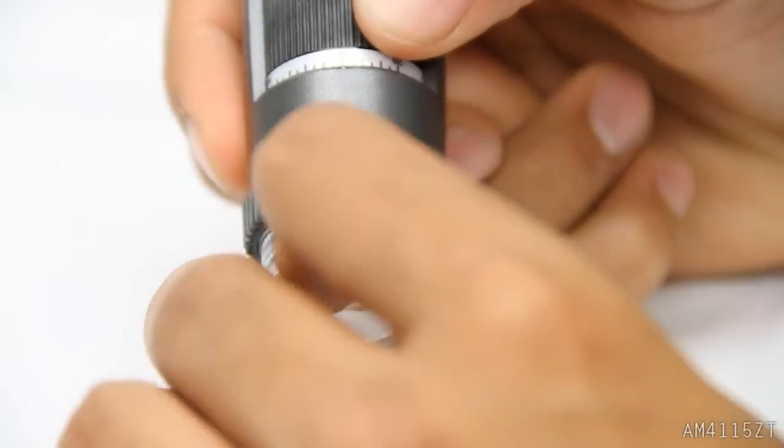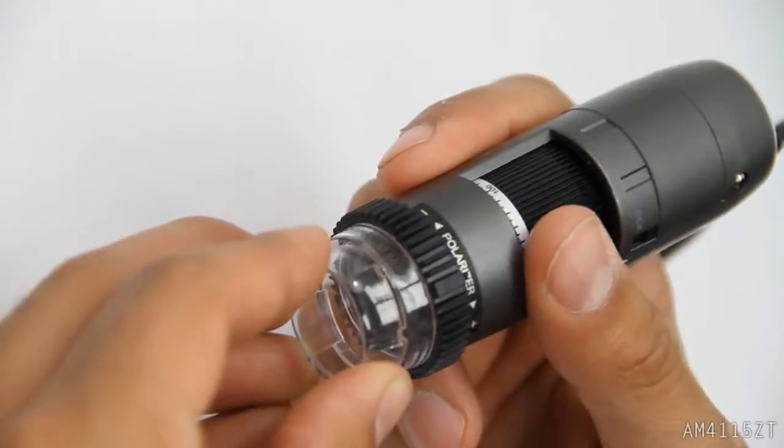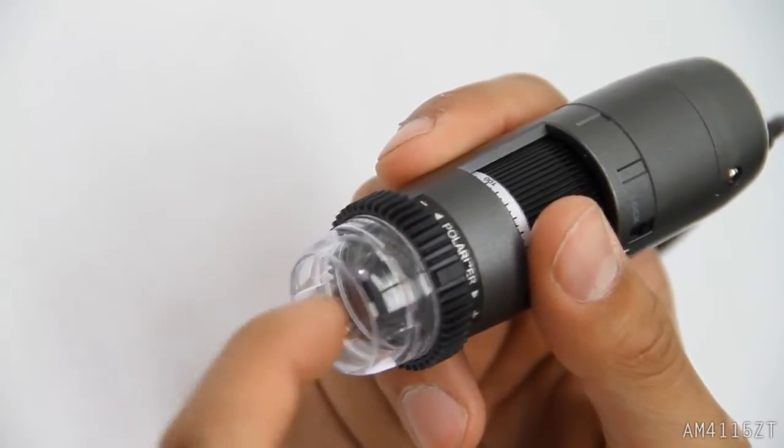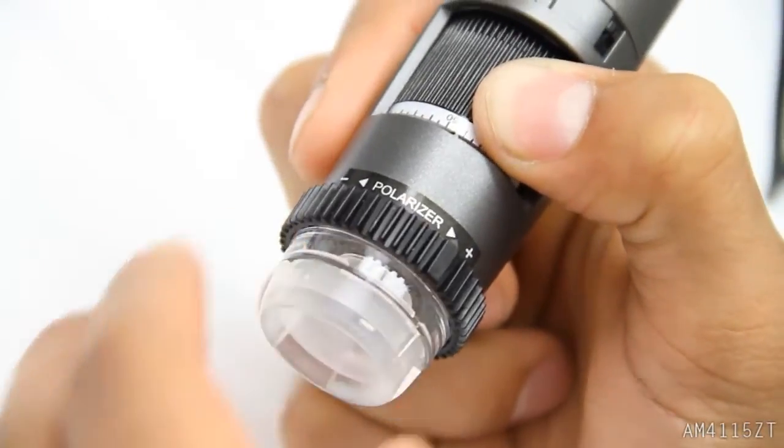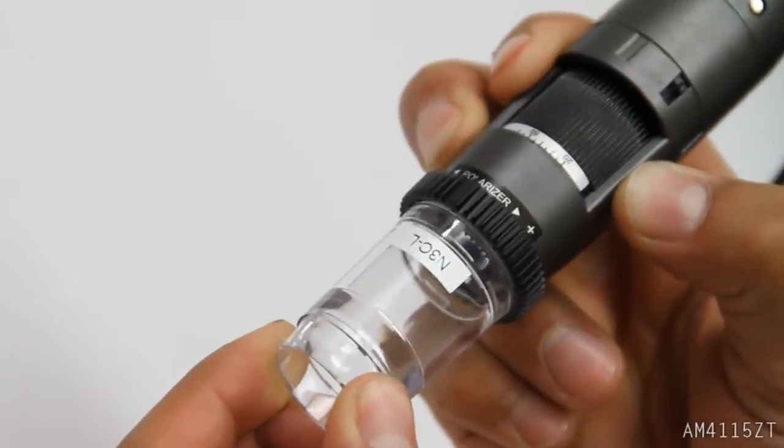The interchangeable cap design allows users to remove a cap for extra working distance or replace it with other useful caps including a sealed cap, diffuser cap, or extended cap.